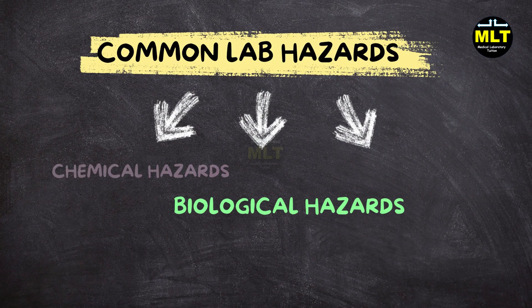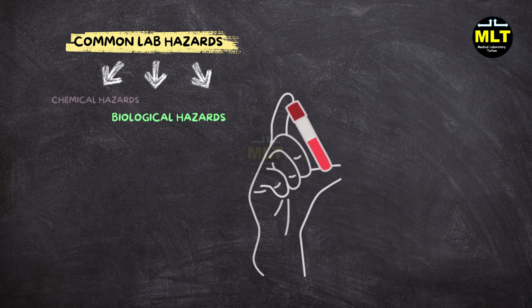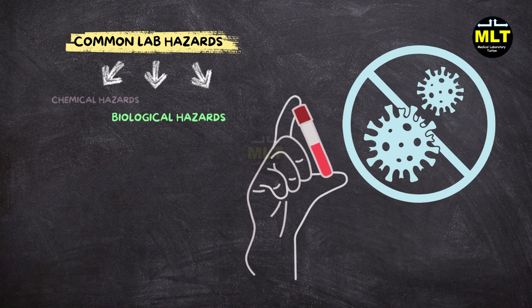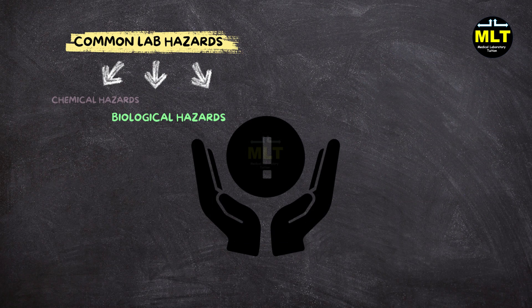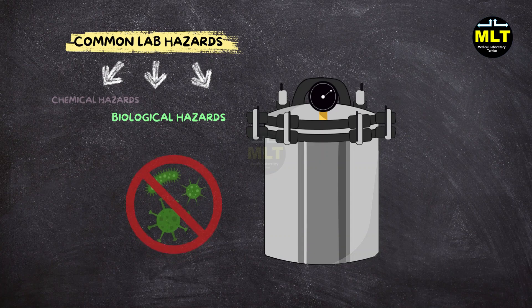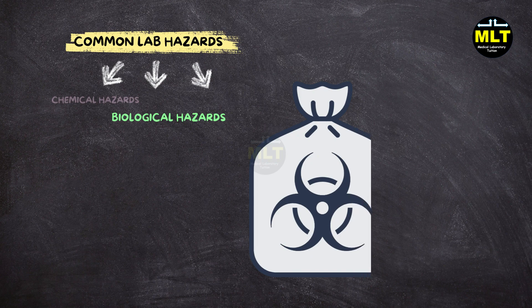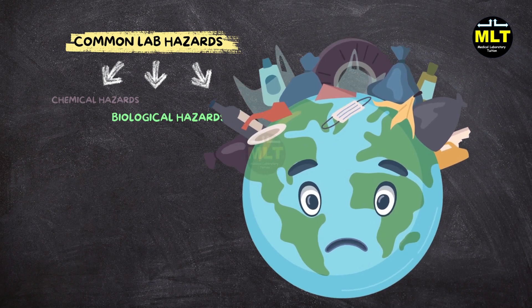Biological hazards: Working with blood samples or infectious agents means you need to be especially careful to avoid exposure. Always handle specimens with caution and follow proper biosafety protocols. Techniques like autoclaving help eliminate harmful germs and keep the lab clean. Always throw away biological waste in biohazard containers, as improper disposal can lead to infections or environmental contamination.